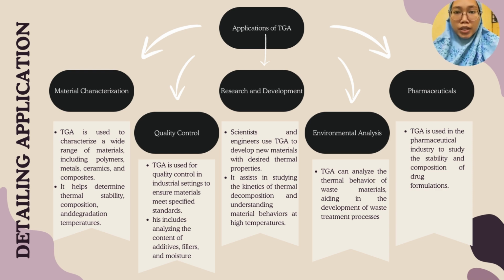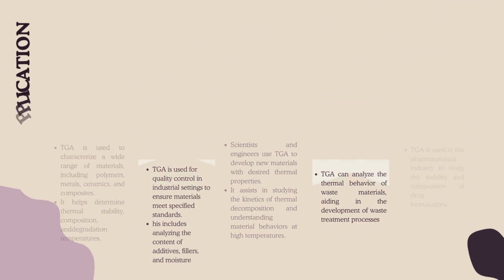Next point is environmental analysis. TGA can analyze the thermal behavior of waste materials, aiding in the development of waste treatment processes. The last point is pharmaceutical. TGA is used in the pharmaceutical industry to study the stability and composition of drug formulations.